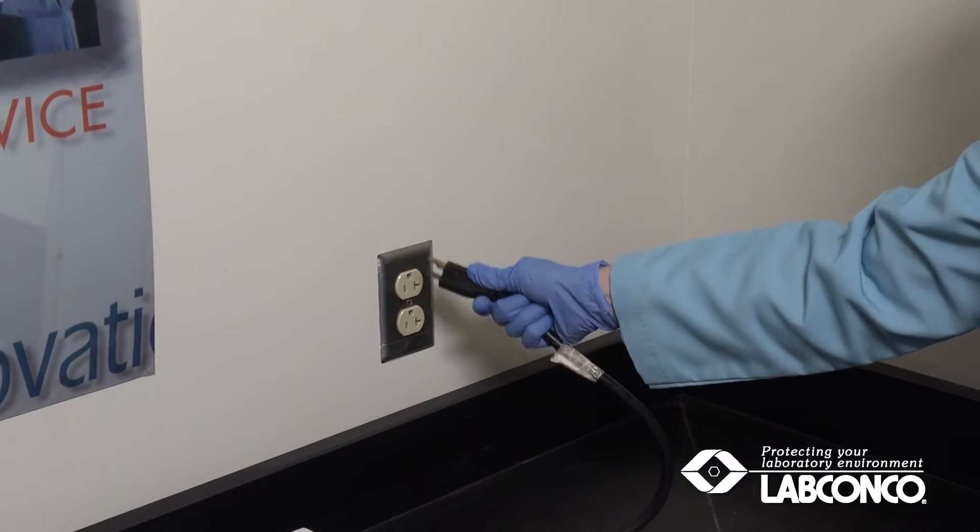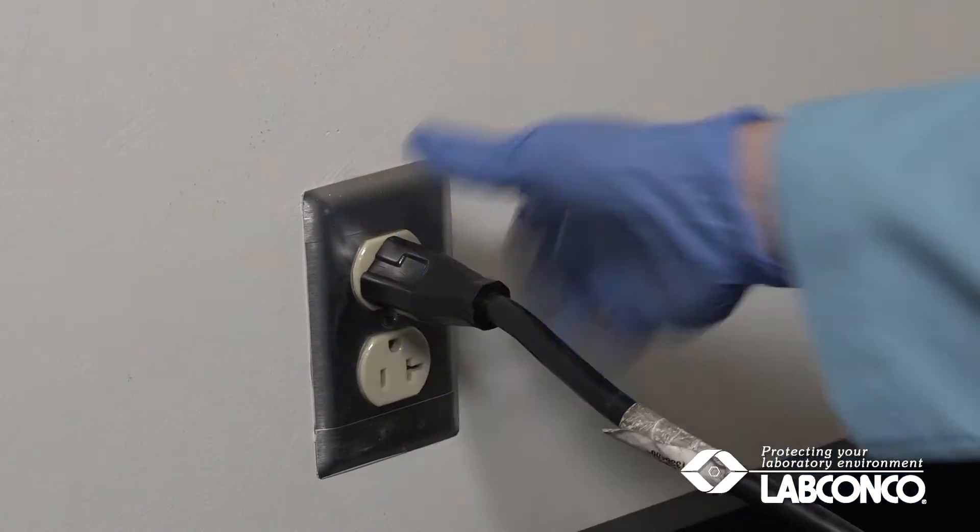Now plug the power cord into the wall receptacle and your RapidVap is ready to use.